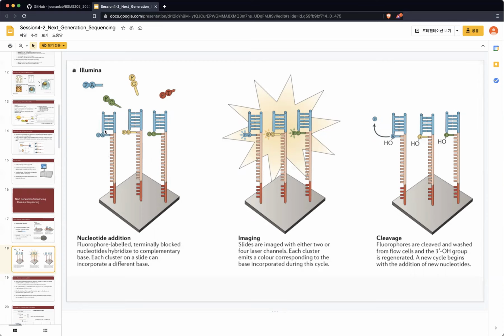So once you have the primers on the library, you get each position sequenced, and you get the synthesis by the sequencing, right? The first cycle has certain nucleotides on this and this and this, right?